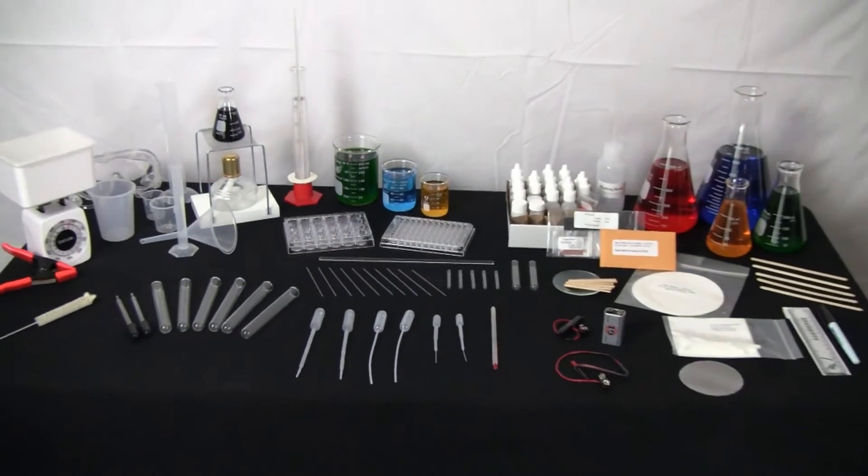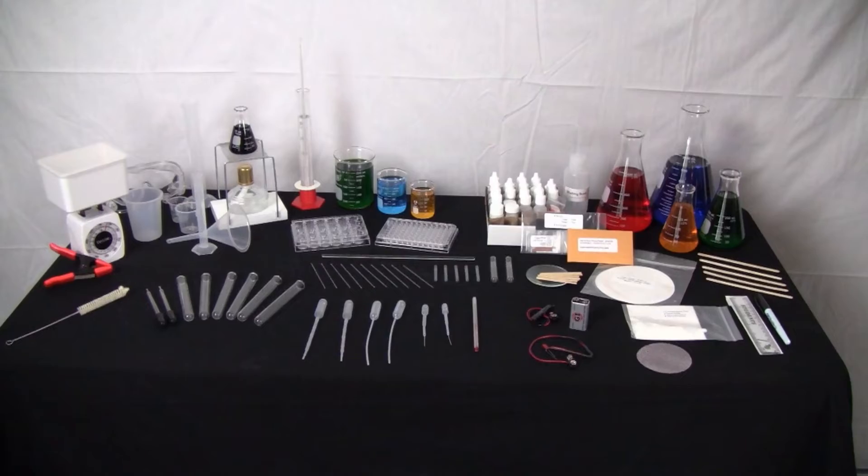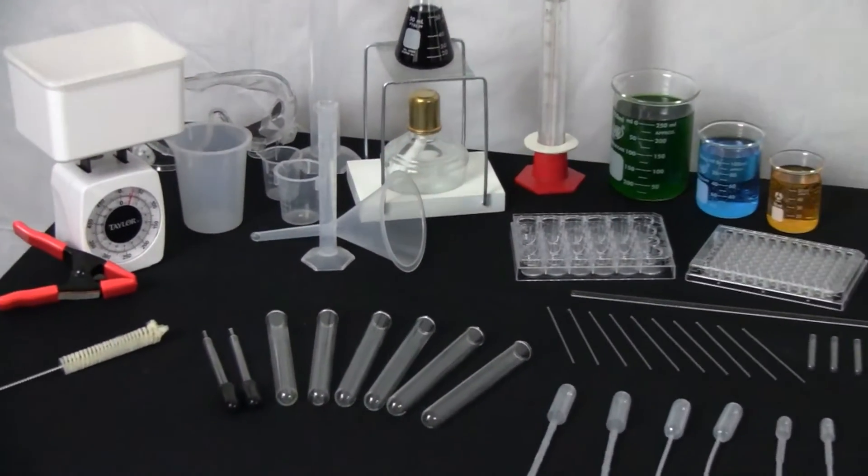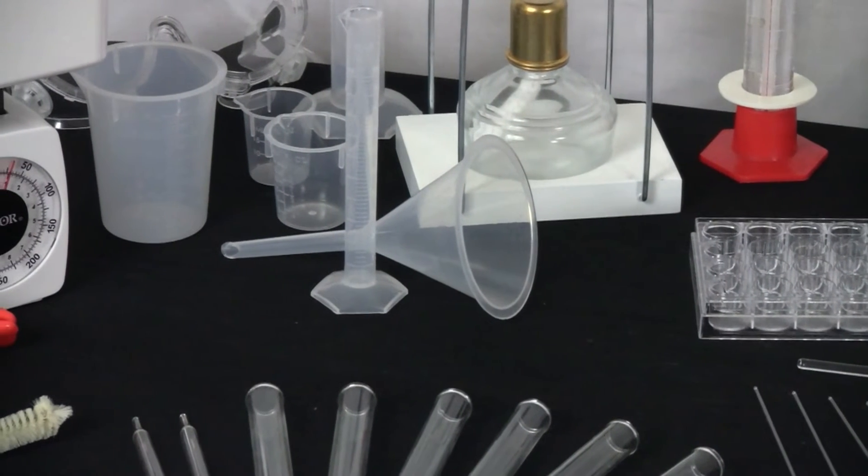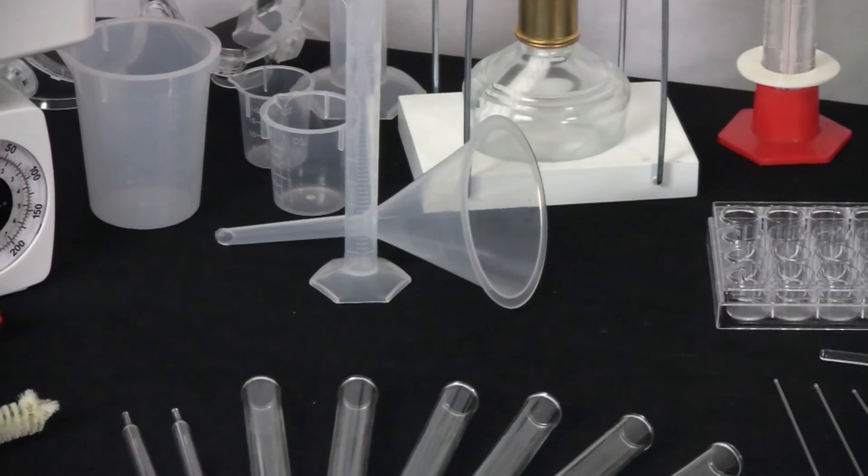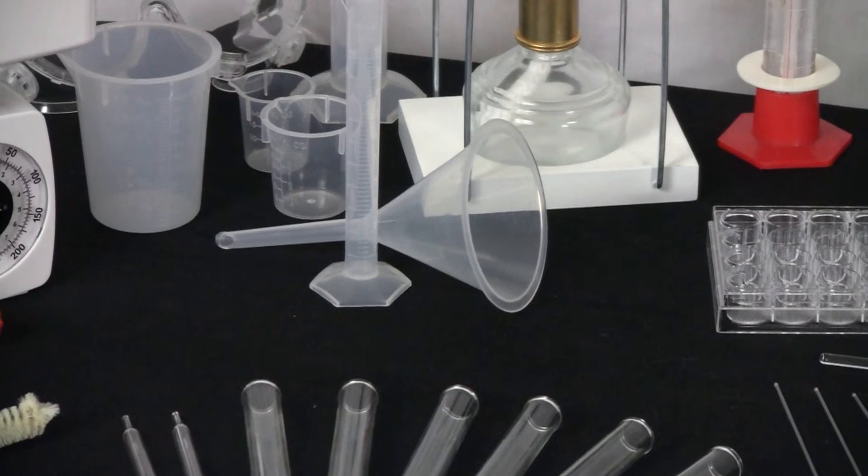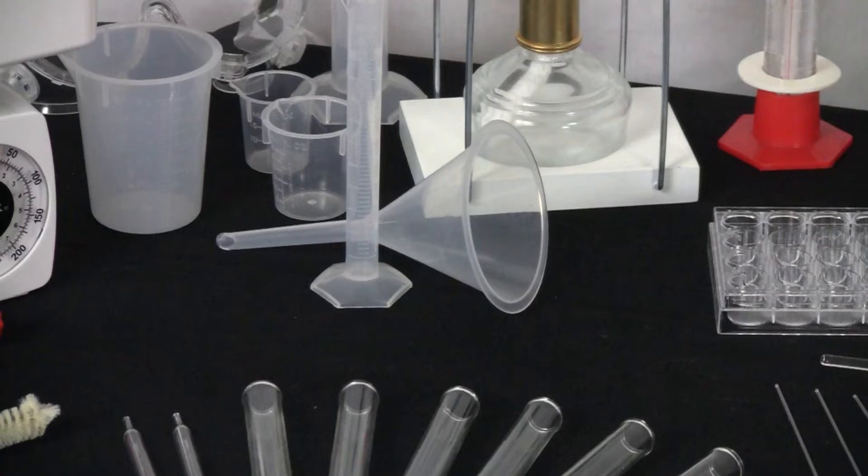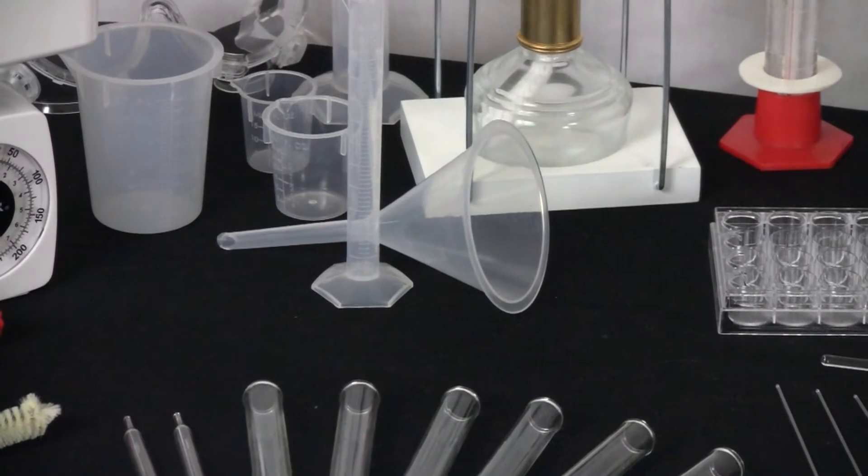Our next item is the funnel. Funnels are necessary in our chemistry experiments in order to be able to pour something into another substance that has a small opening at the top.